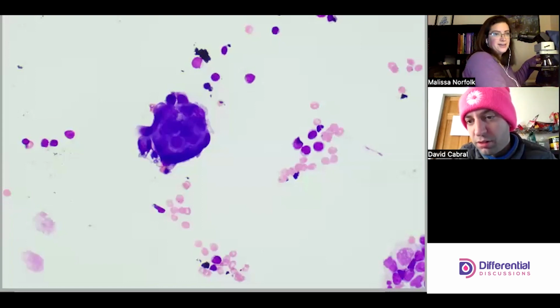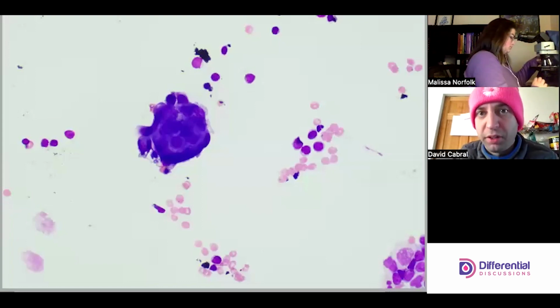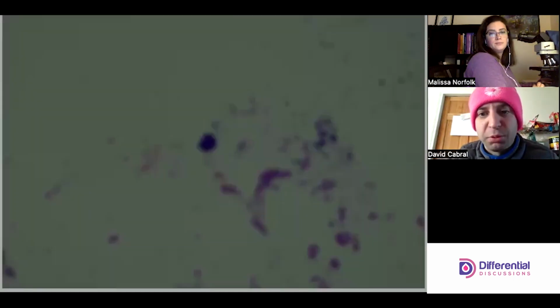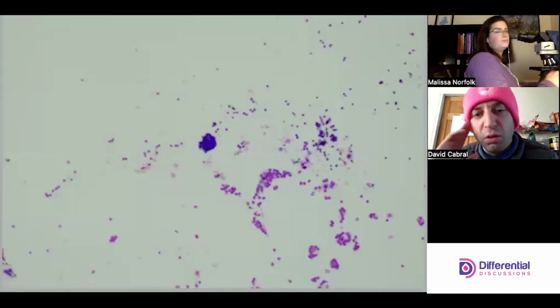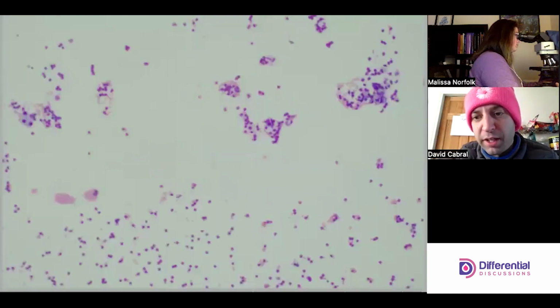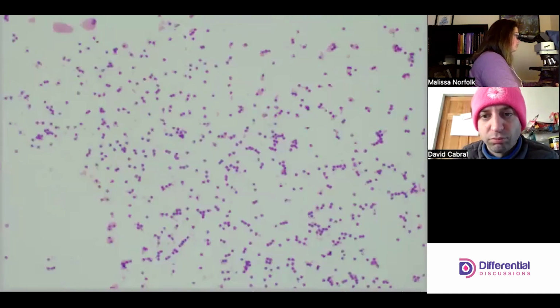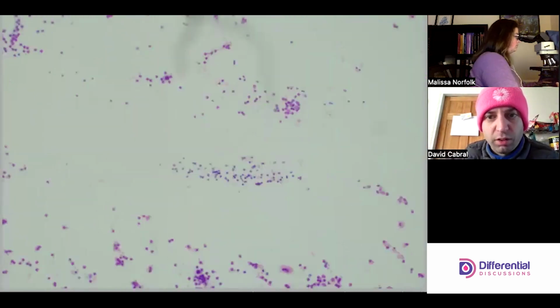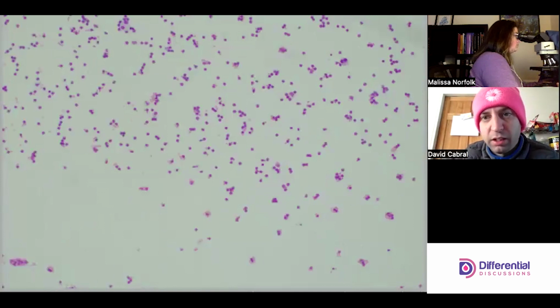All right, I'm going to go back to 10 so we can continue. Probably a good idea. Bring down the light. As morphologists, we're taking note to ourselves that we saw something like that, keeping that in mind, and seeing what else turns up. I see a little bit of red cells, not too bad.